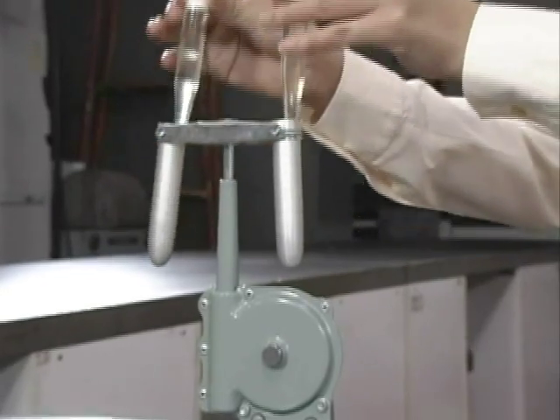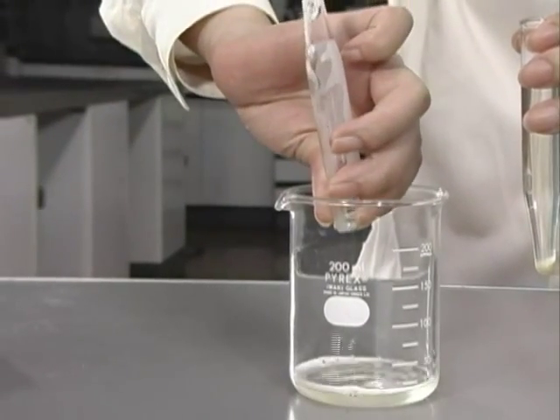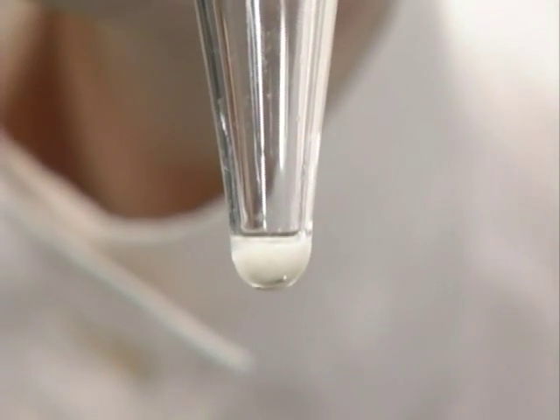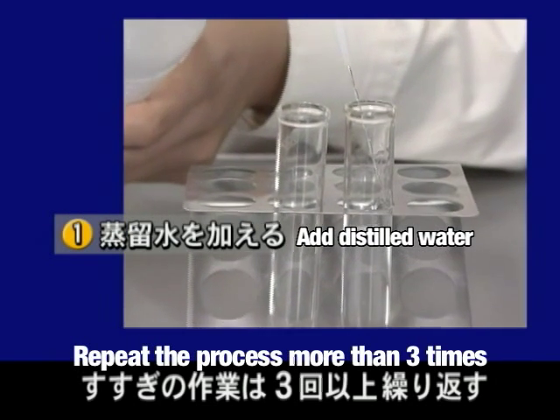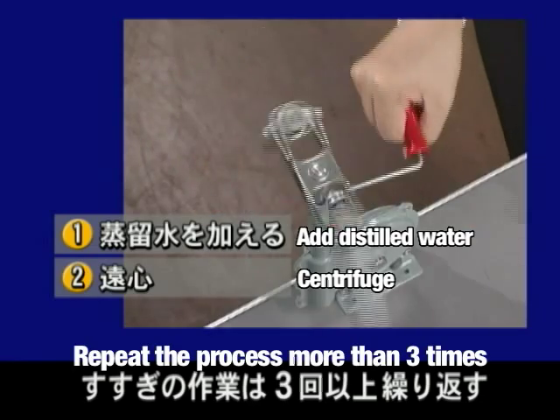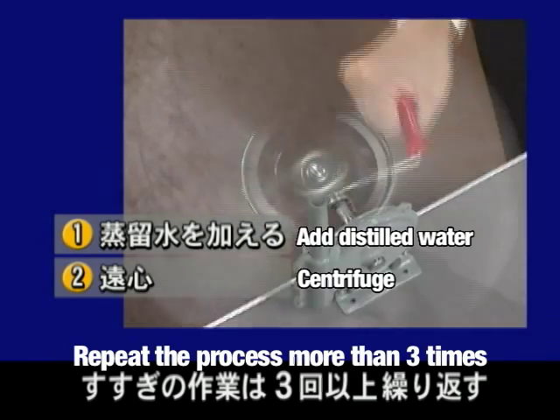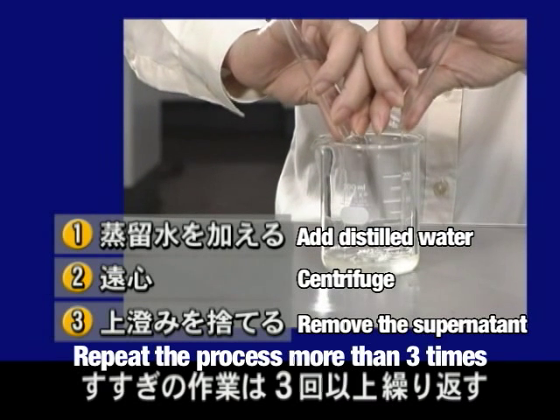After centrifugation, the supernatant is decanted. Even if the tubes are completely flipped over, the diatoms will not leave the tube with the decanted liquid, because they adhere to the tube. The dilution process is repeated at least three times. This process is necessary for removing the drain cleaning product. If this product is not removed, good slides cannot be prepared.